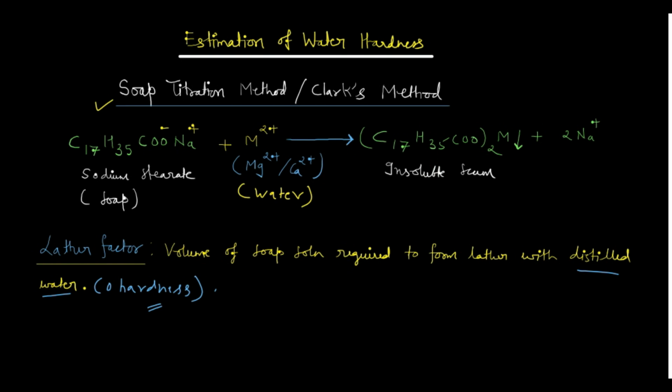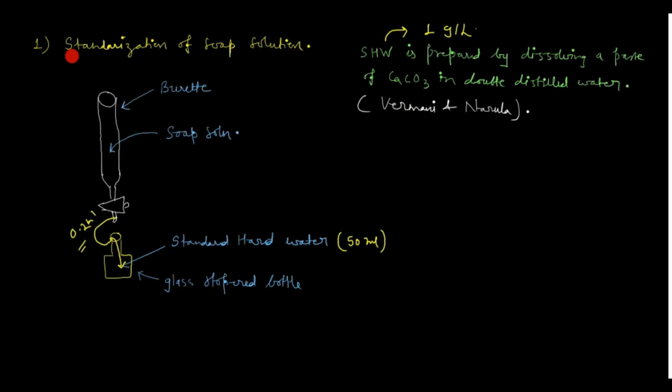Now moving to the next slide. So my first method, see what I am doing. First I am doing the standardization of the soap solution. If you have seen my lecture on estimation of water hardness by the EDTA method, then there also I have explained the method of standardization.